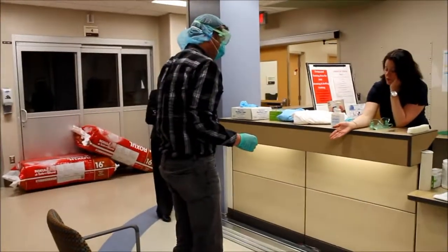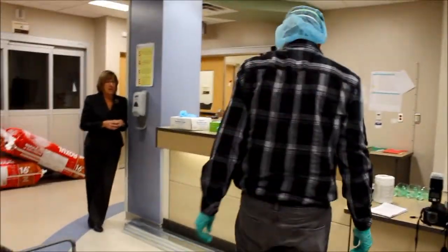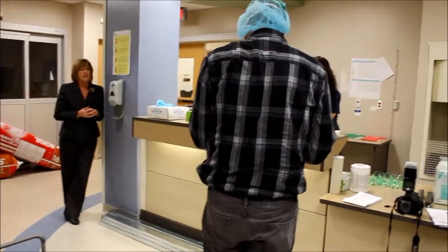When you took the boot cover off, you're stepping off the mat onto a clean surface. And then you can take those inside gloves off.